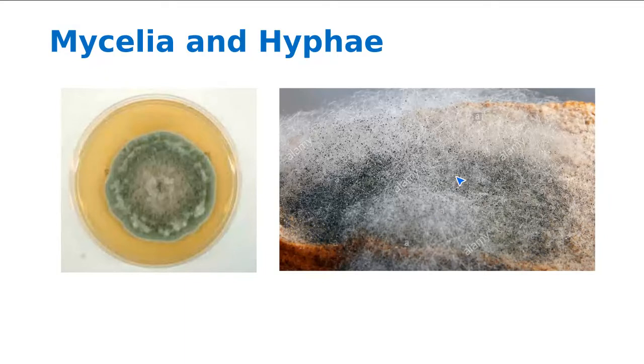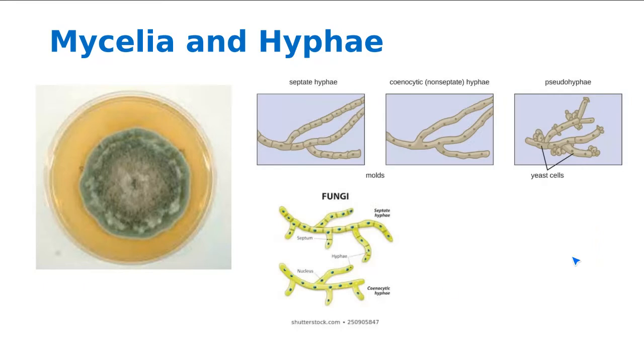It's a fast grower. So for instance, if you look at your bread on, I don't know, Monday, and there's a little bit of mold growing, if it's Rhizopus, you come back Tuesday morning and your bread is completely covered because it grows that fast. Okay? So that mycelia can either be aseptate, no cross walls, or it could be septate, has cross walls. If we look at this for just a minute, here you can appreciate the difference. Here you can see that they have cross walls. This is septate mycelia. It's called a hypha.